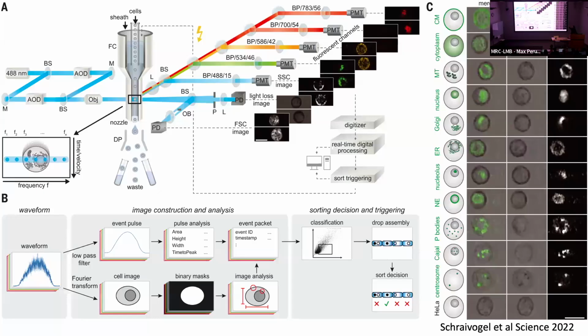I would say morphology is maybe a strong word here, but at least some kind of imaging phenotype with a purified population of interest downstream, which is, I think, going to be very crucial for things like CRISPR screening, and even downstream from that, CAR T cell therapy, stuff like this. So I think it's going to be a real game changer. This one is at a flow speed of about 1.1 meters per second, which is basically the general flow speed of cells in cell sorting.